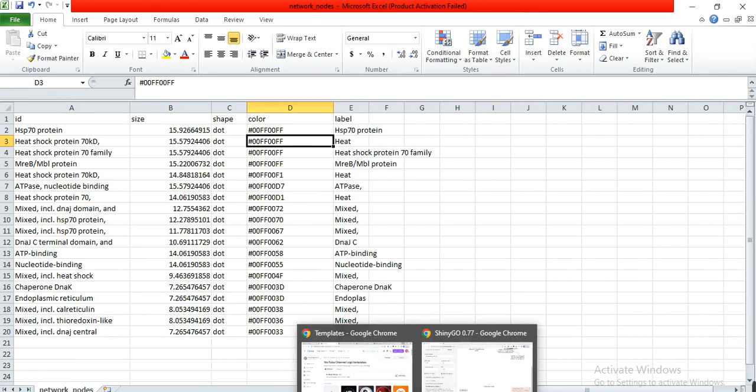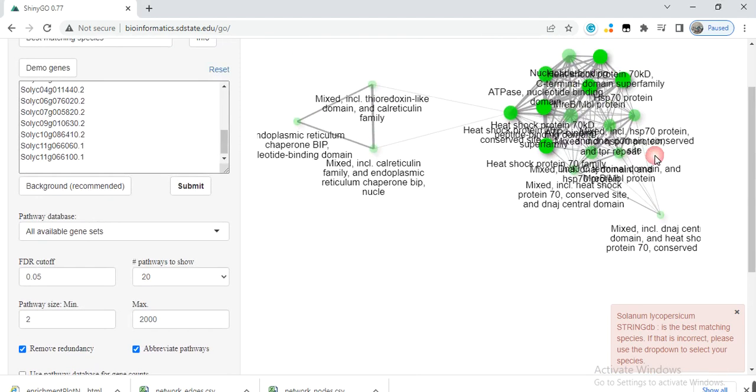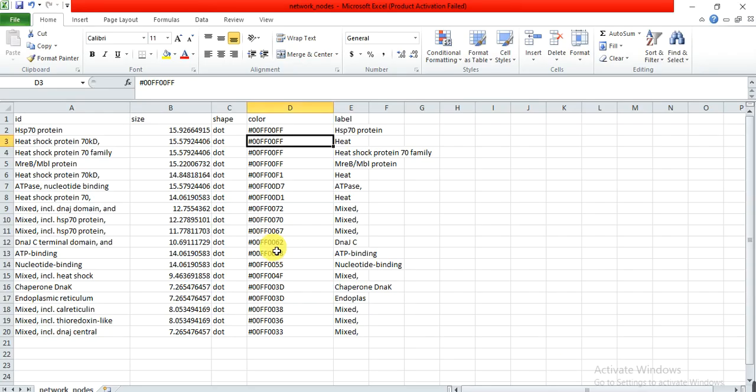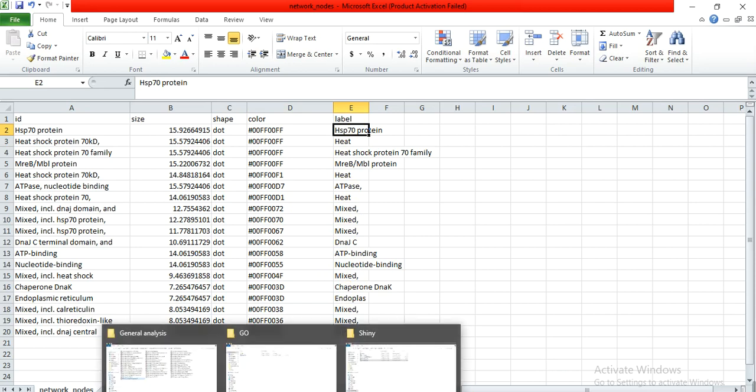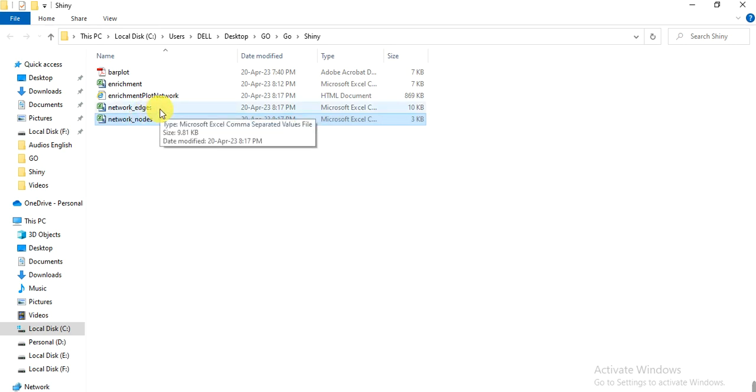It gives the color and then gives the interaction between genes—which gene interacts with which one. This is the label gene, and there is information about network edges.